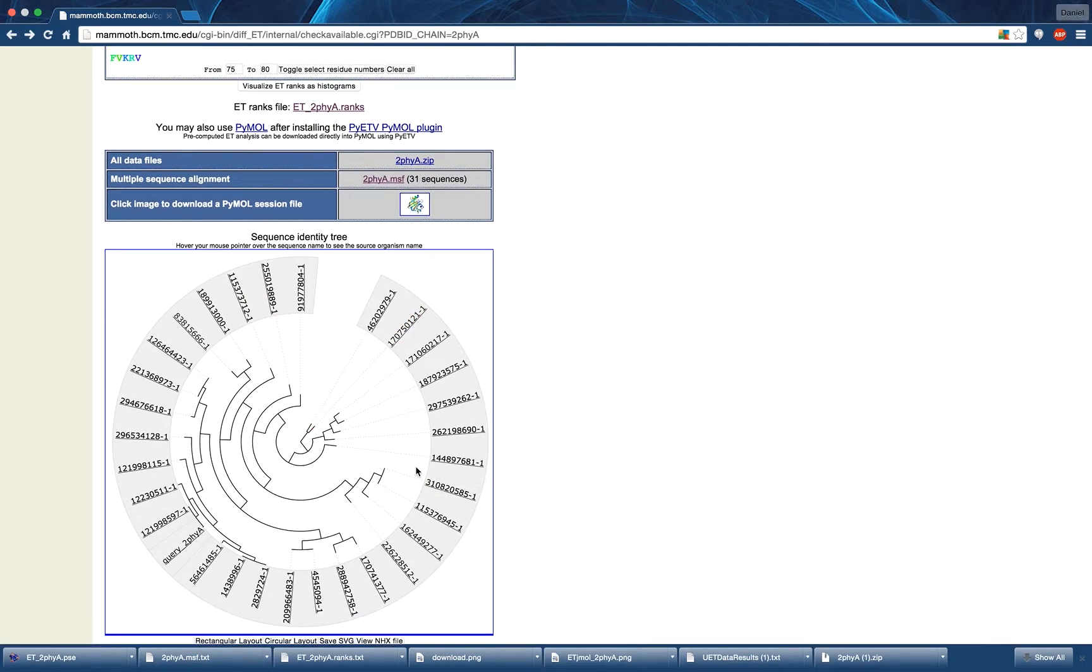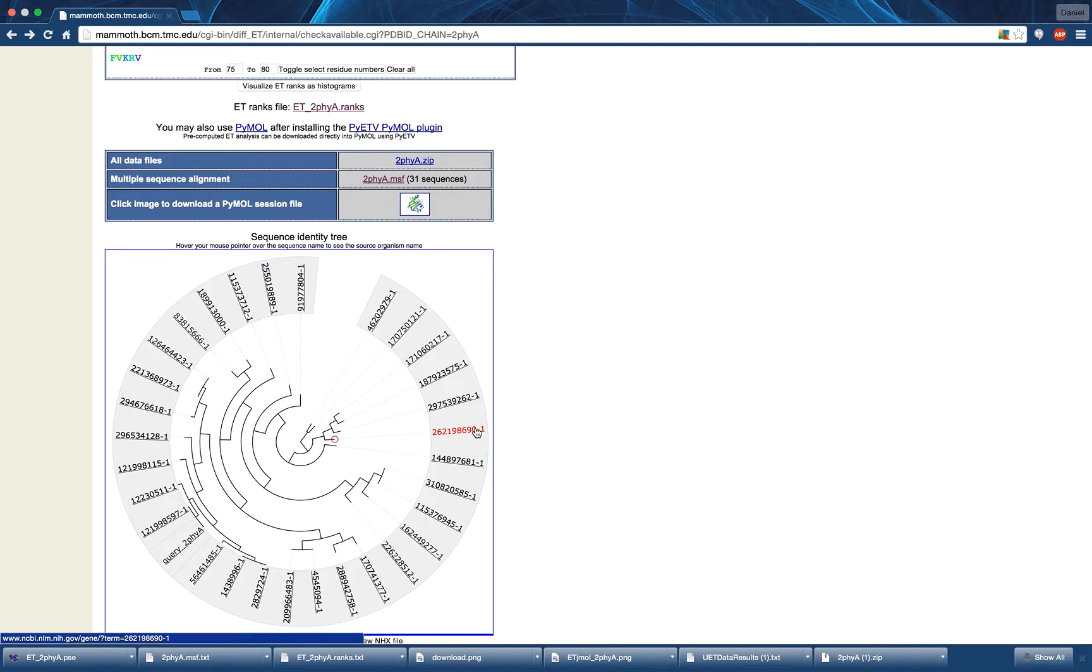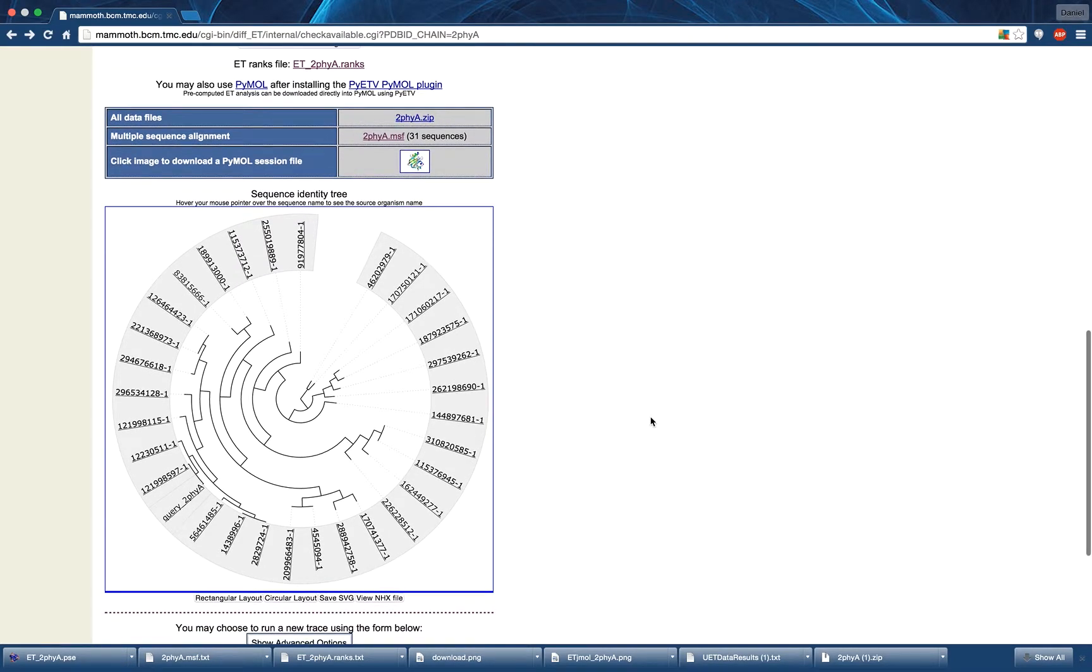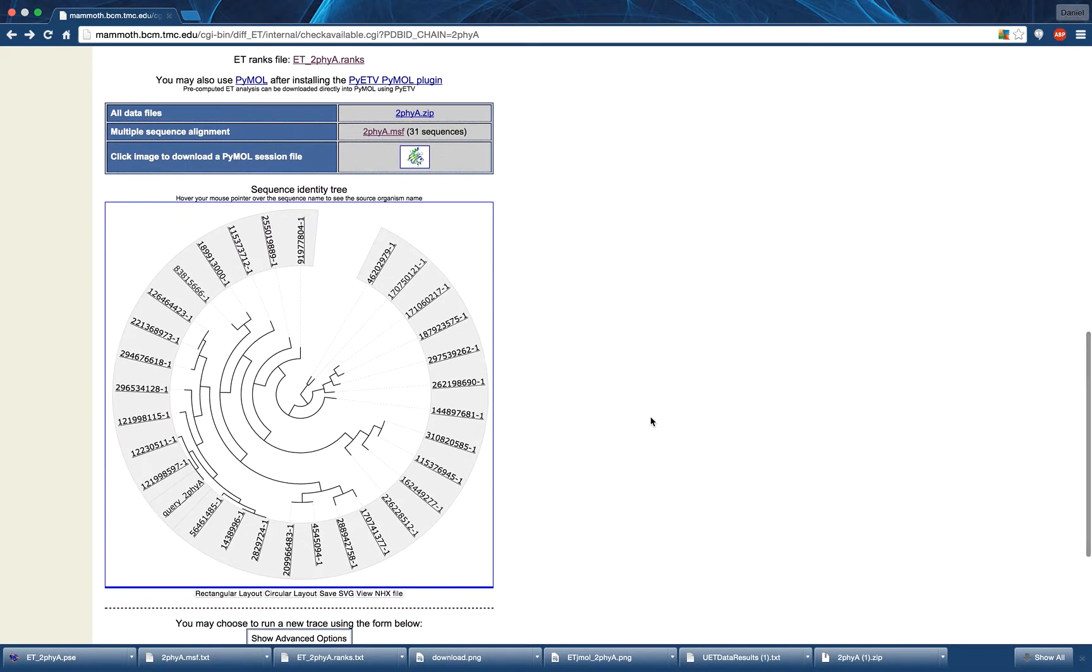This is also covered in another video found in the annotation. By hovering over a value in the tree, you can reveal the species responsible for that entry. You can also change the shape of the tree by pressing the Rectangular Layout button.